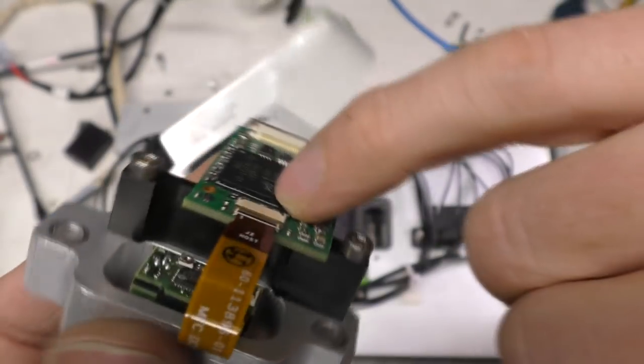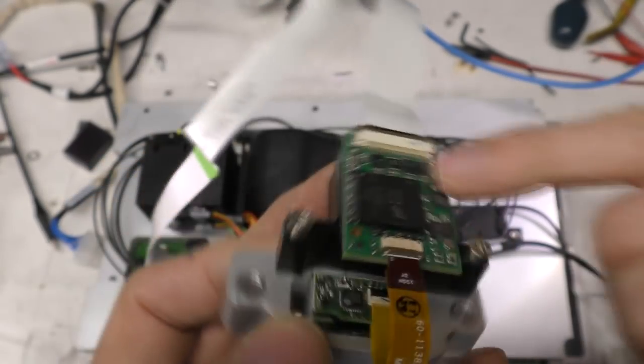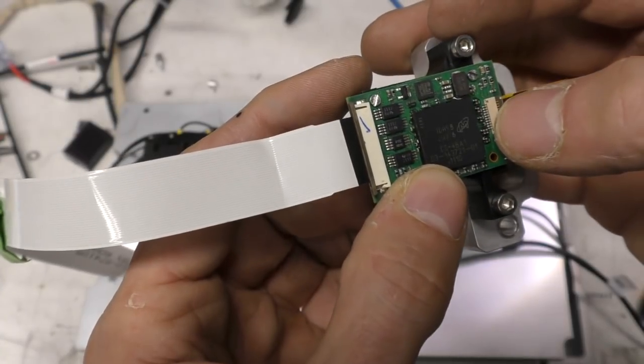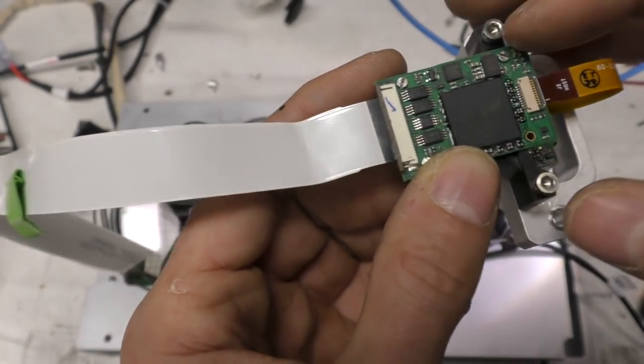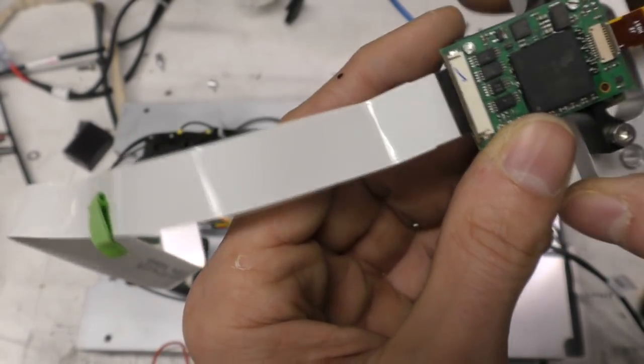This chip on the top is a Micron flash chip, so it looks like this is on top of another. It's probably one of the various system on chip devices, with an image interface and a reasonable amount of processing to decode the barcode.